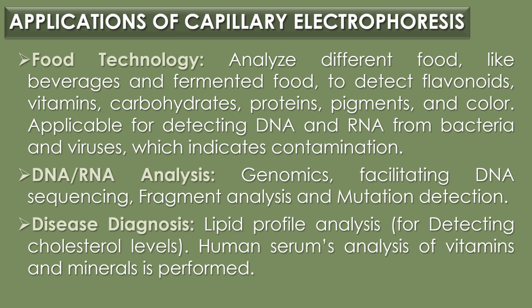The second application is DNA or RNA analysis. Capillary electrophoresis plays a major role in genomics, facilitating DNA sequencing, fragment analysis, and mutation detection. The third application is disease diagnosis. Lipid profile analysis using capillary electrophoresis is critical for detecting cholesterol levels in clinical laboratories.